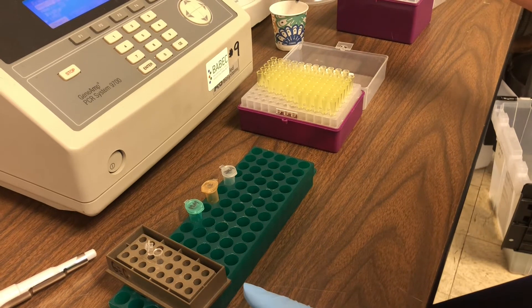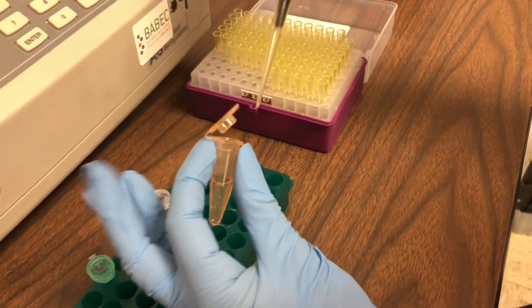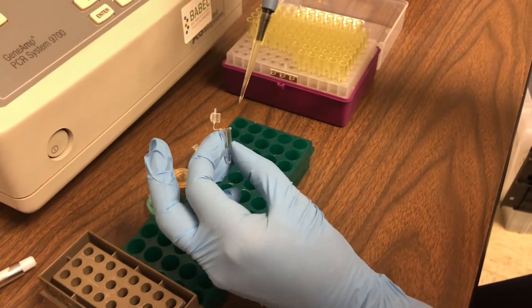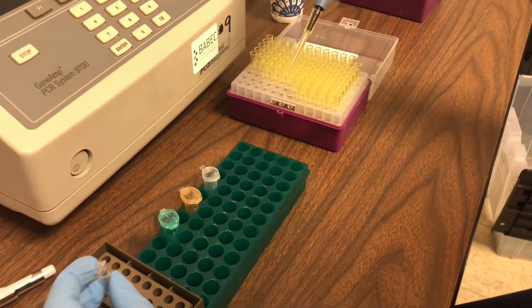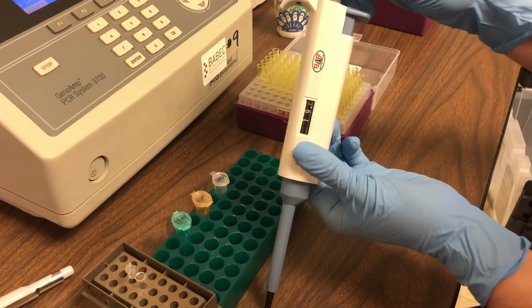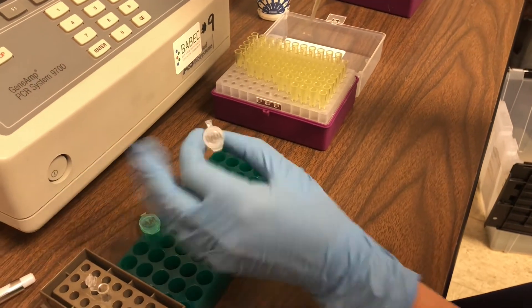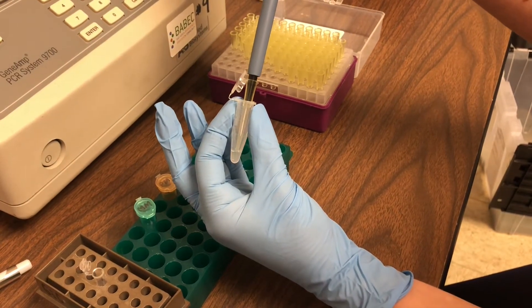The next thing we're going to add is something called primer mix. Primers attach to specific pieces of DNA, so when we're doing PCR we're not making millions of copies of just any DNA — we're making millions of copies of our target DNA sequence, and the primers allow us to do that. Our target DNA sequence in this example is that 35S promoter region. The last thing we're going to add is 10 microliters of the DNA that we extracted from our corn chip sample.